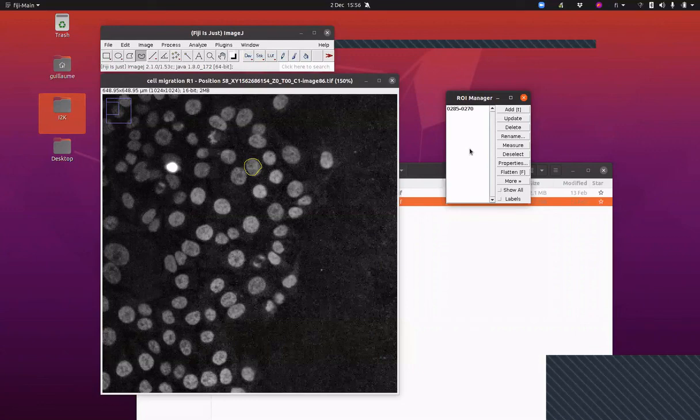But then you can use that model and the StarDist Fiji plugin to accelerate the annotation of more images. It's a huge time saver because it might take you maybe 10 hours to annotate 10 or 20 images. Then you train a model, and then you can annotate another 50 images in another 5 hours or so. So you can really speed up the generation of new annotated training data using this kind of strategy.